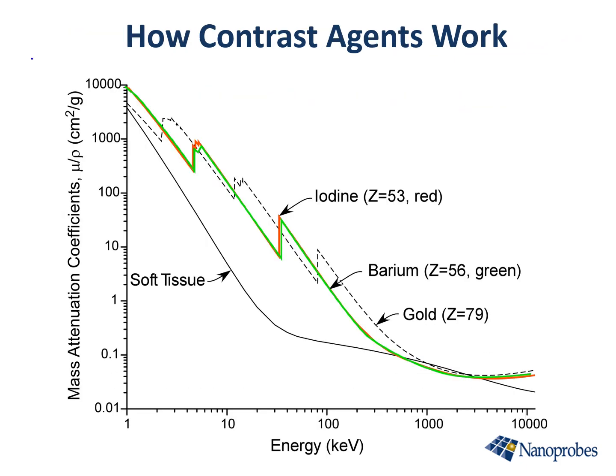Contrast agents work by absorbing X-rays very strongly at specific energies, and therefore regions that are highlighted or filled or stained with those contrast agent elements show up very brightly in the CT scan. Different contrast elements absorb at different X-ray energies, like iodine, barium, and gold. This provides a method for highlighting different components of specimens and contrasting them and overlaying them to see the relation between them.